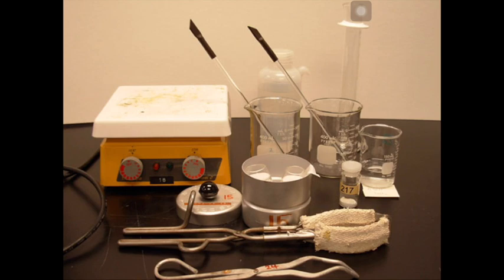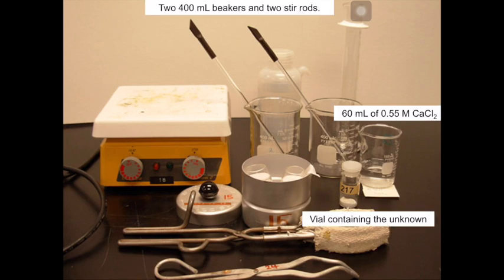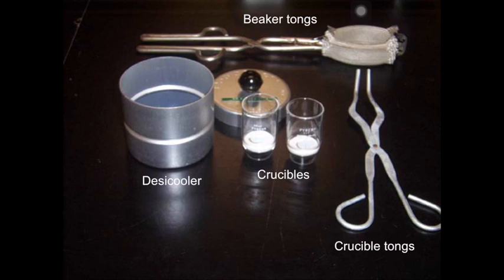These are the things that we are going to use for this type of experiment. You have a vial containing the unknown 217. You have 60 ml of calcium chloride, two 400 ml beakers, two stirring rods, and a hot plate. The hot plate is used to heat objects and liquids in particular. You also have beaker tongs, crucible tongs, and crucibles.